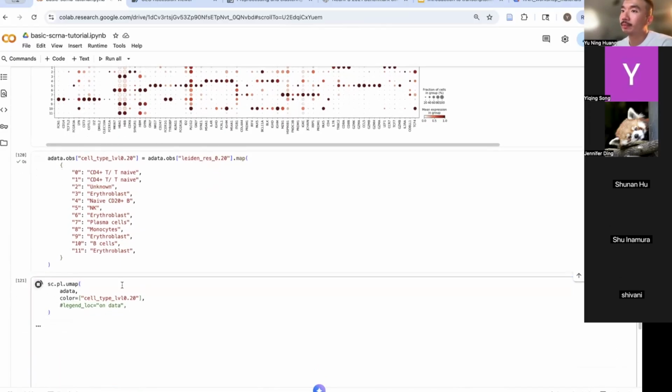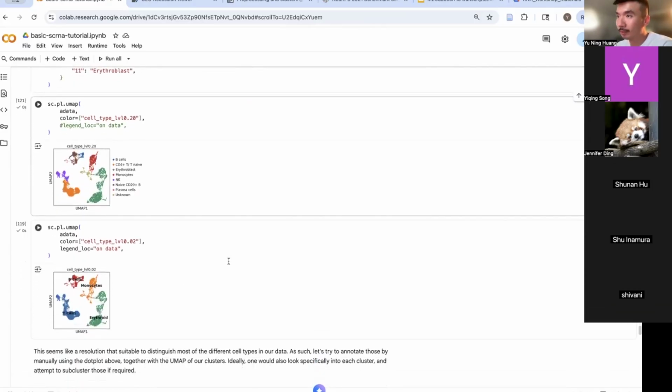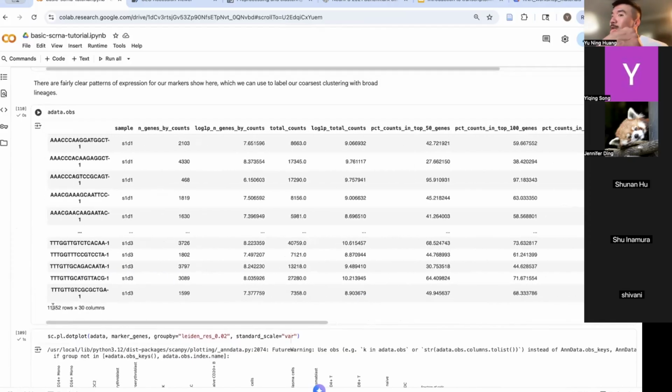This may be a stupid question, but this is the final result of single cell RNA-seq of the 20,000 cells that you gave as a sample. Yeah, it started with 20,000, but now after quality control, it's left at about 10K, 11K now, because I filtered out 9K.